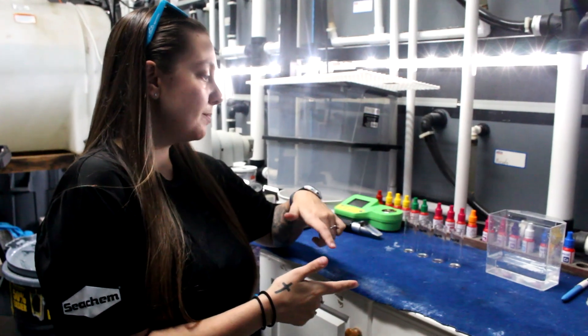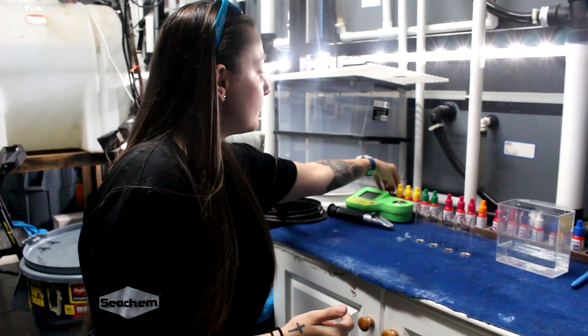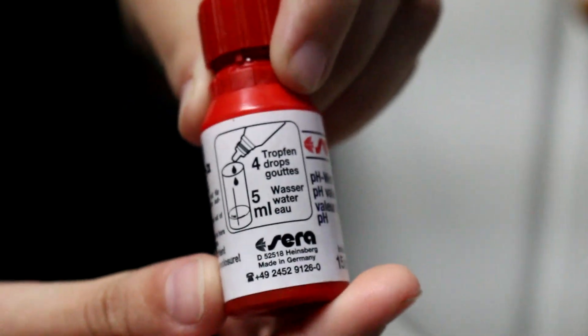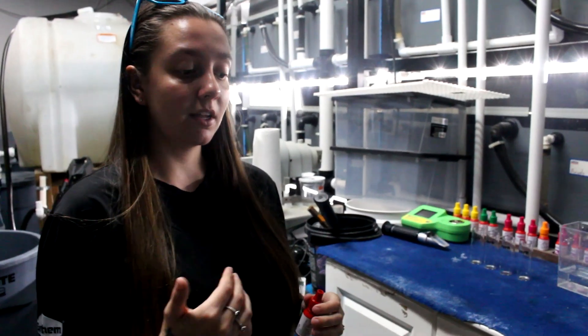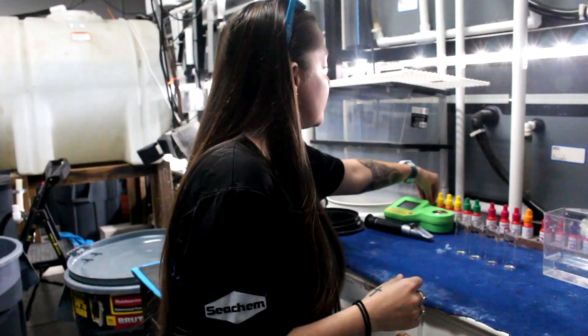We're back here in the back of the store where we test all of the water. If you look really closely at one of the bottles, it tells you exactly how many milliliters of water you need and exactly how many drops to put in. All of the information you need to test your water is right there on the bottles — it's very easy. They also come with a little pamphlet inside that has all the instructions as well.